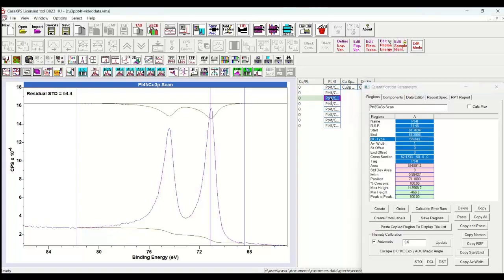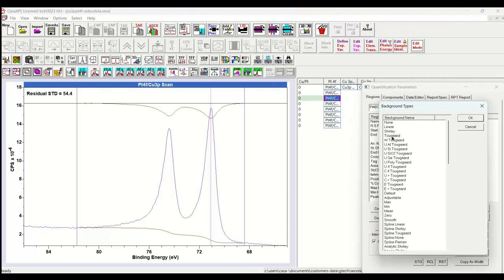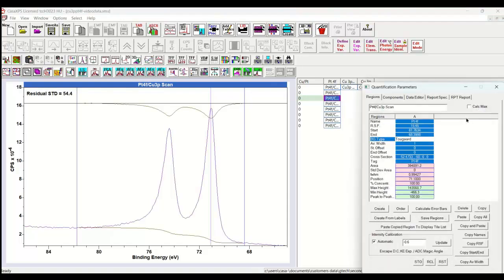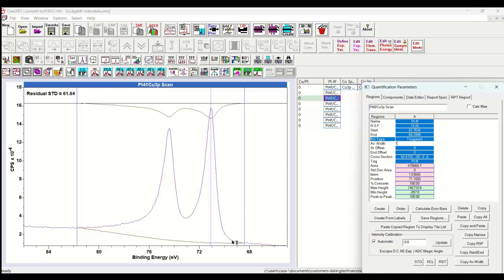Let's put in another example. This time let's choose a Tougaard background, there's a universal cross-section. And it produces a shape that is dictated by a set of coefficients that were defined by Tougaard. So here we have it applied to the platinum peak. Again, it does not really match our expectation of what inelastically scattered electrons ought to do beneath photoemission peaks in a metal. But nevertheless, this is another choice for a background.